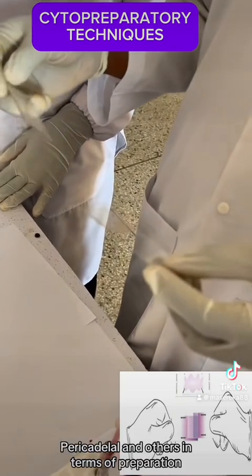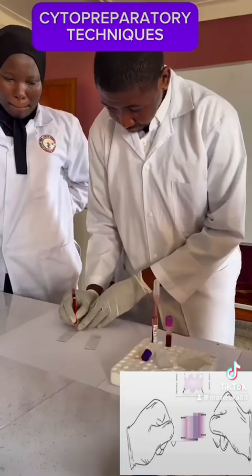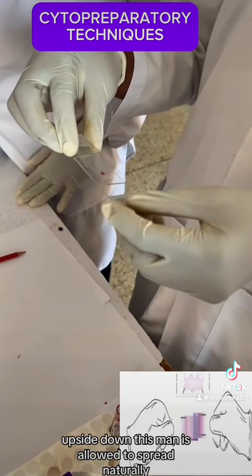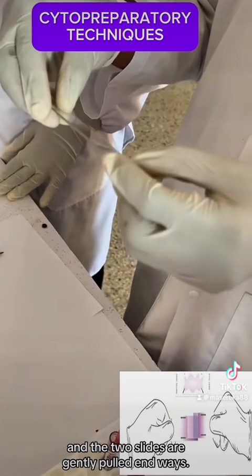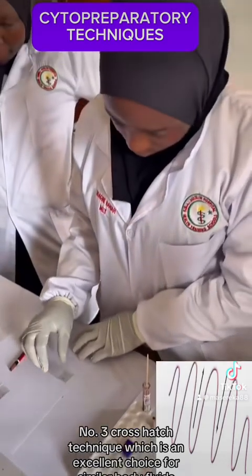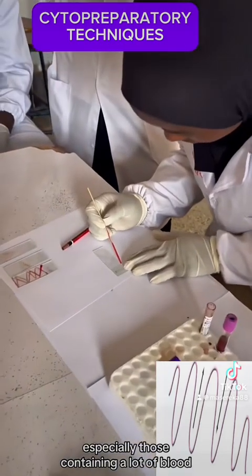In terms of preparation, 2 to 3 drops of the specimen are placed on a labeled glass slide, and another labeled glass slide is put on top upside down. The specimen is allowed to spread naturally, and the 2 slides are gently pulled endways. Number 3, crosshatch technique, which is an excellent choice for cellular body fluids, especially those containing a lot of blood.